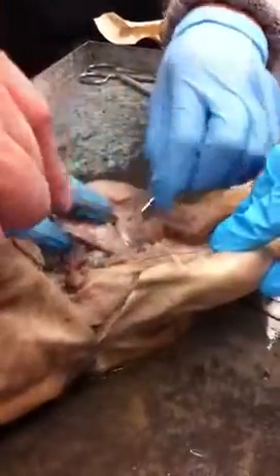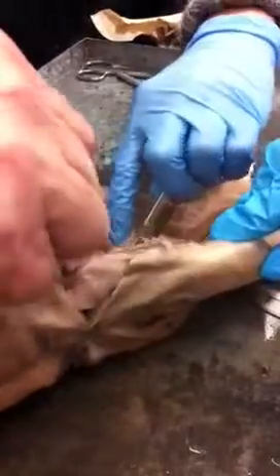Let me cut through right here. We should be able to find a femoral vein and artery in there, and then we can trace it back. Over to the side in the flesh over here. Okay, there you go. Maybe they didn't get very well injected, because again, you can see the artery good, but I don't see any blue veins.